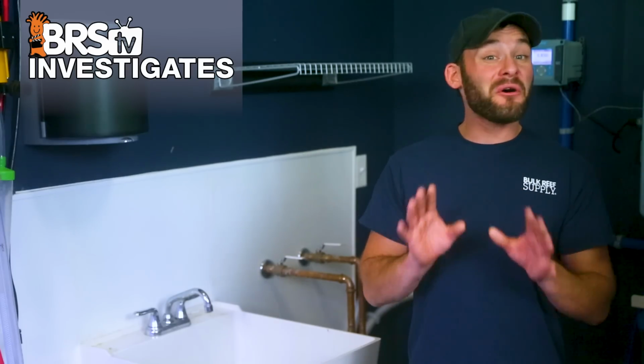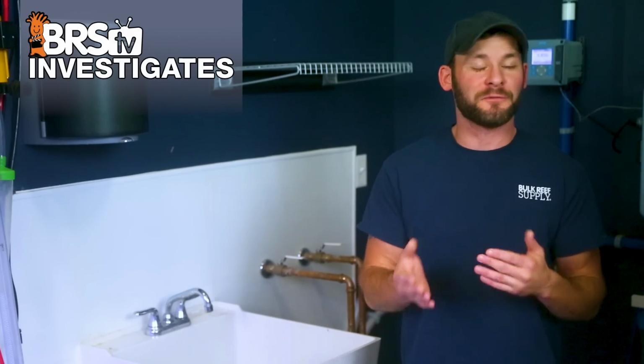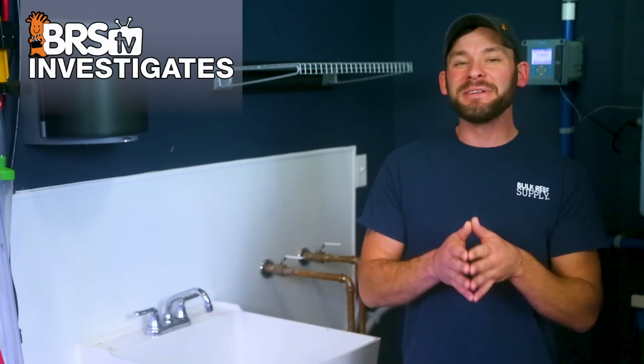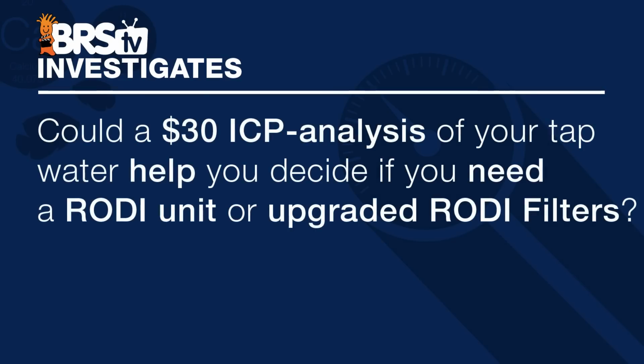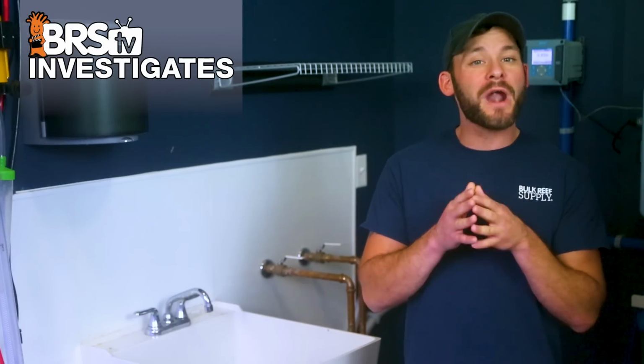We get questions all the time from people who ask if they need a more advanced RODI for well water versus city water, or even if they need an RODI system to begin with. And up until now, there really hasn't been a straight answer. So today we plan to change that by answering the question, could a $30 ICP analysis of your tap water help you decide if you need an RODI unit, or maybe, and more importantly for most of you, upgraded RODI filters? Let's find out.